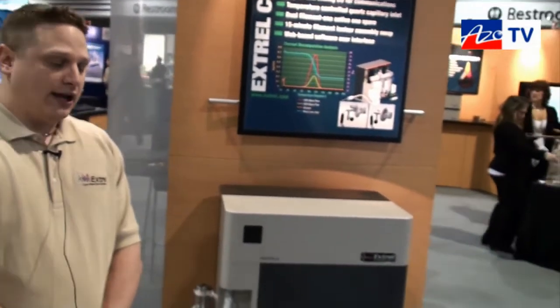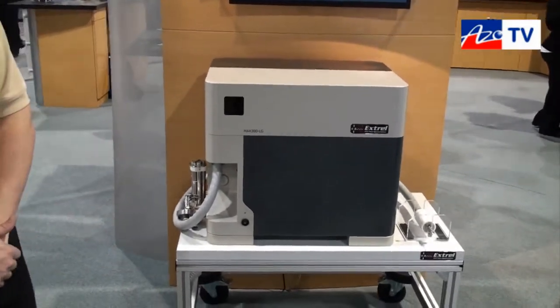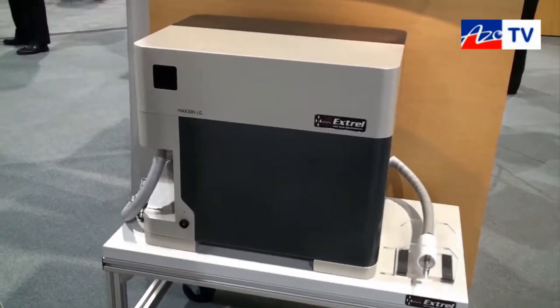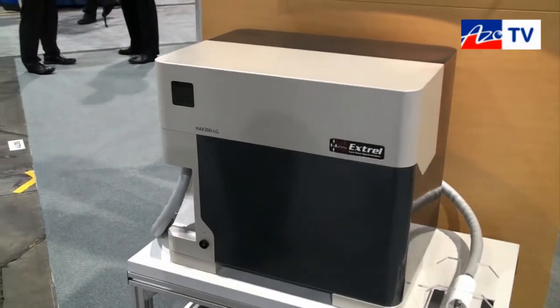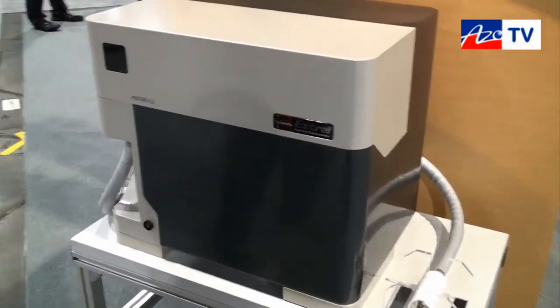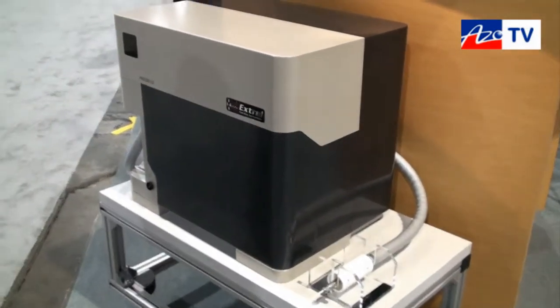What we have here is a mass spectrometer for the TGA application. Here at Xtrell we understand that the TGA application married with the mass spectrometer is nothing new, but with our new quantitative analysis design we're able to monitor many different components and get a true quantitation of the system.